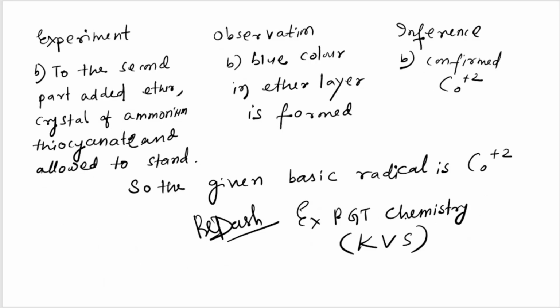And to the second part add ether and crystals of ammonium thiocyanate, and allow it to stand. Then what happened? Blue color in the ether layer.